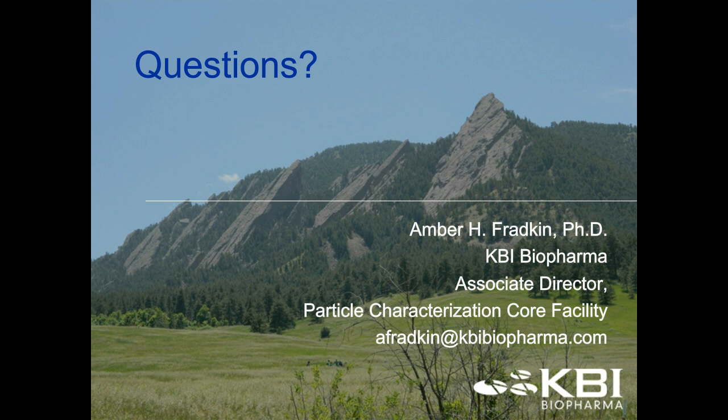So looking at different bags, I think there's a couple of studies looking at different sources of saline, for instance, can have widely different amounts of pre-existing particles in them. I think maybe John Carpenter has a paper coming out soon regarding that. So they can significantly impact the particle profile. So I highly recommend folks characterize those to the best of their ability.